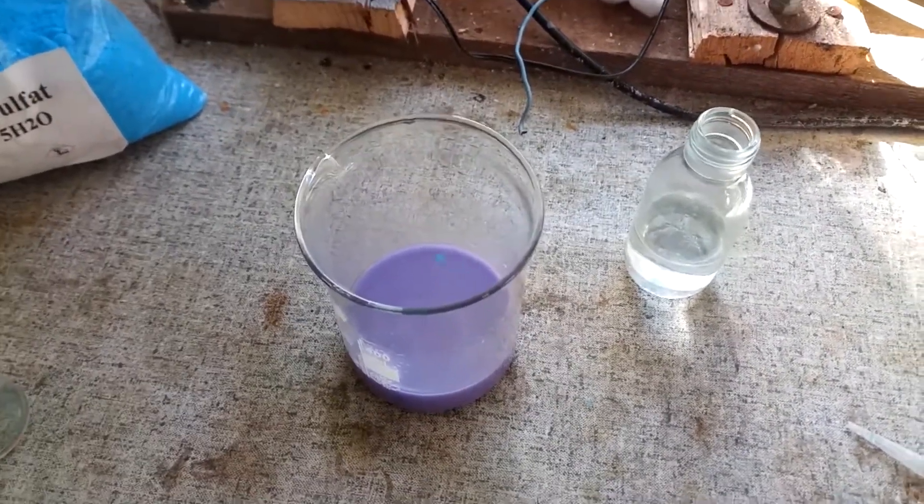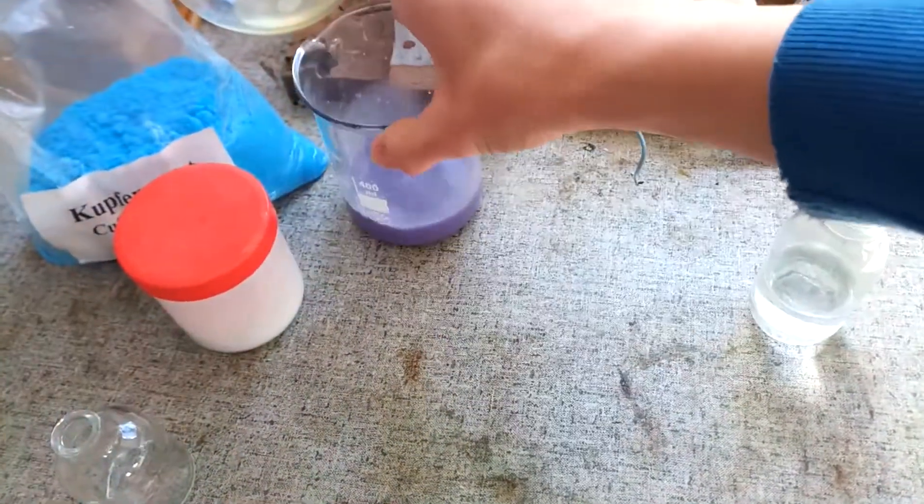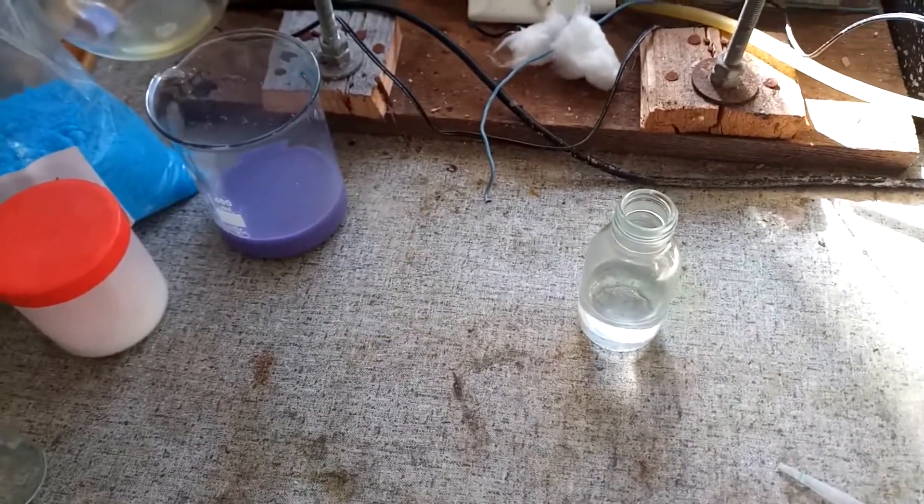Now you might be thinking, what exactly does this reaction have to do with biuret? The thing is that biuret also gives a positive result for this test.